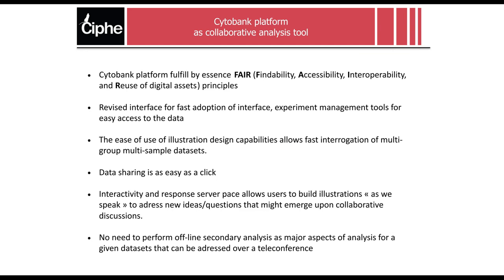So just a few lines to sum up. I hope I showed you and convinced you that Cytobank is a platform that fulfills by essence these FAIR principles that are more and more asked for in the field of data science. So your data should be findable, accessible, interoperable, and reusable as digital data sets. If you combine sharing data experiments on Cytobank using label tags that are descriptive enough so that people can find by themselves what you actually did, you really are fulfilling this principle.